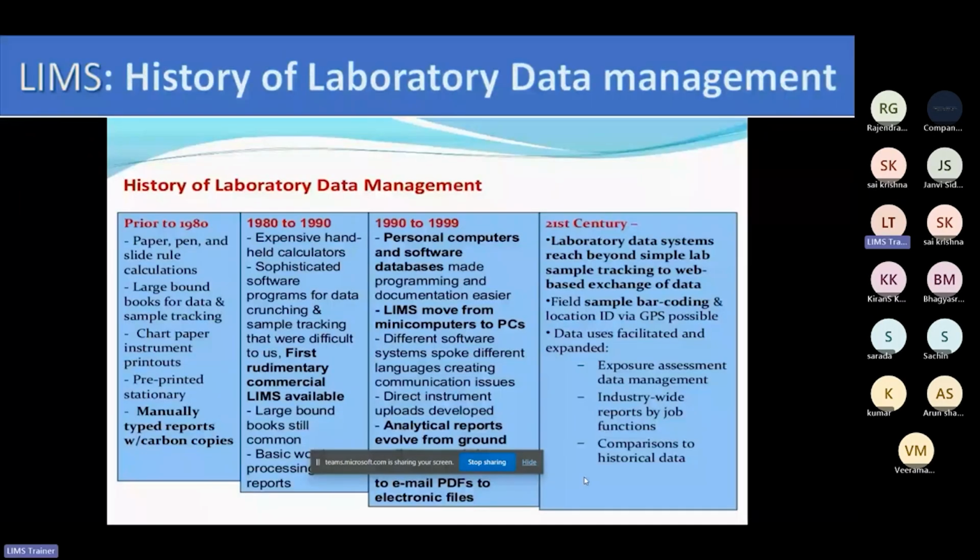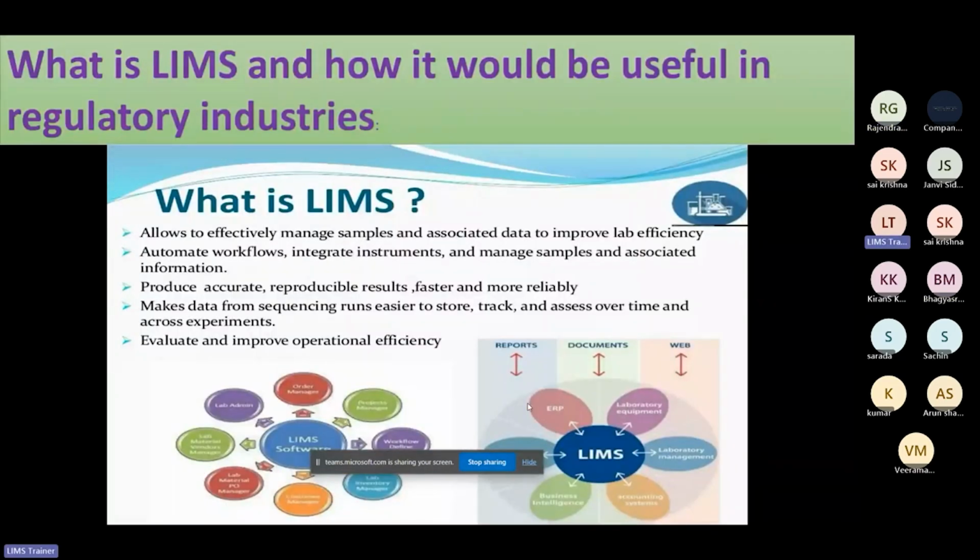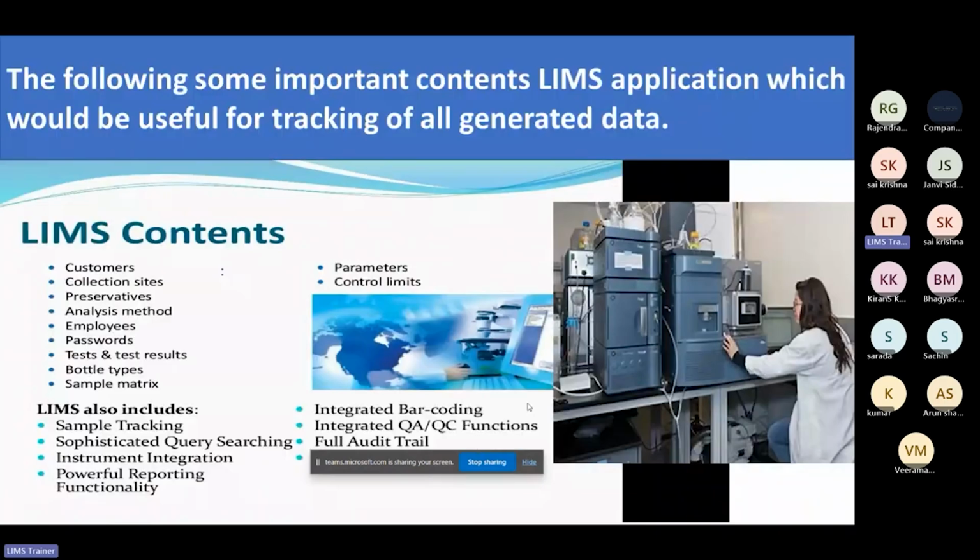Now is it visible? Yes, sir. So now I'm on the history of laboratory data management page. Is it visible? Yes. Okay, now I'm going to the what is LIMS slide. Is it visible now? Yes. Okay, so now I am on LIMS contents. Is it visible? Yes, okay.